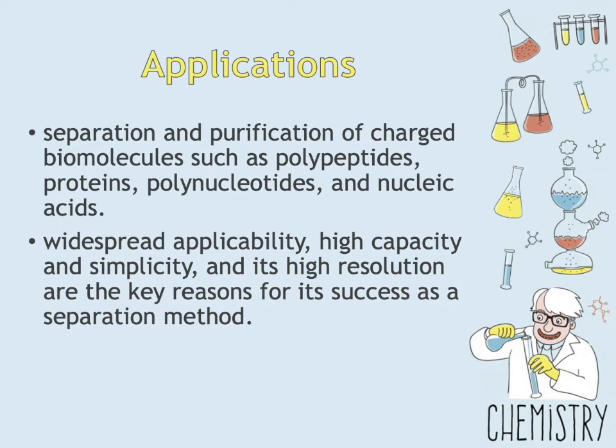Ion exchange is the most widely used chromatographic method because it has widespread applicability, high capacity, and simplicity, and its high resolution are the key reasons for its success as a separation method. And ion exchange chromatography is widely used by analysts.